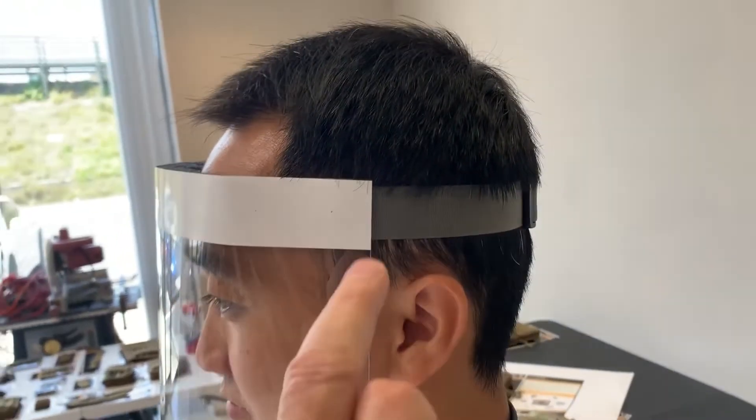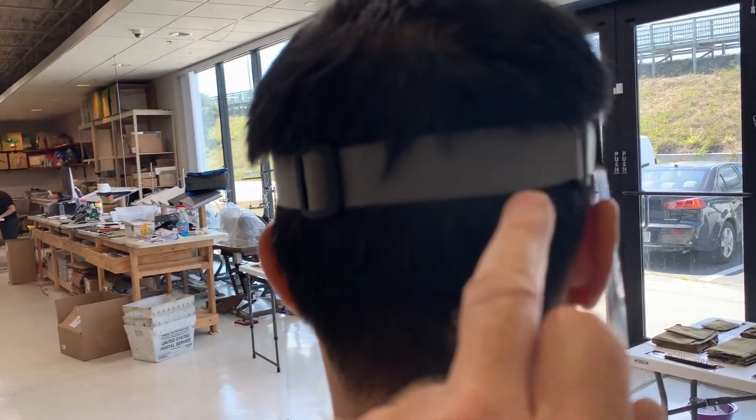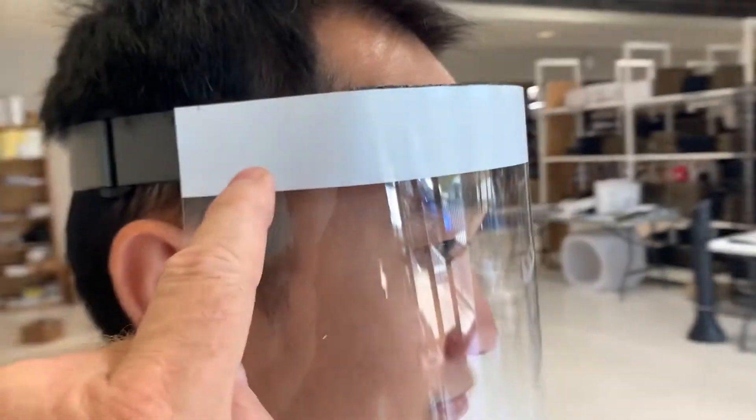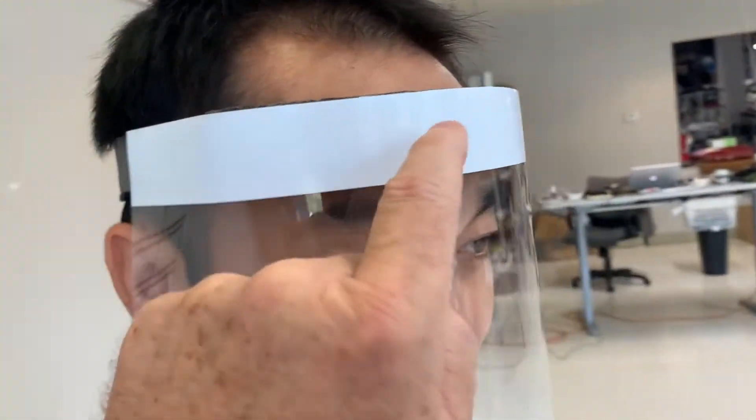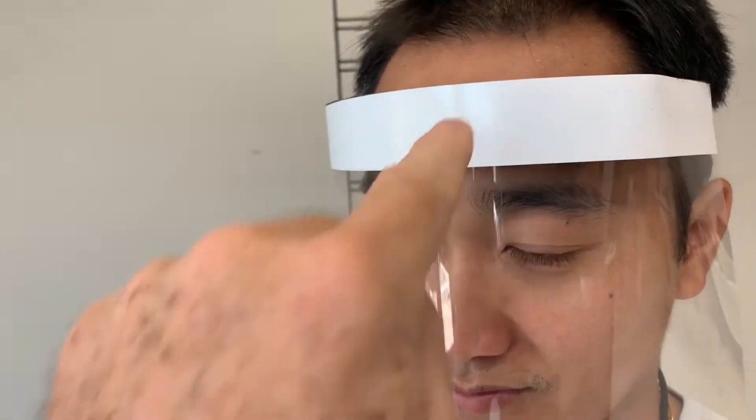We have an adjustable strap on the back so you can adjust it. Once you've adjusted it, it just stays in that position. Also on the front, we have a white area here that you can mark right on there, so you can use a permanent marker right on top of this.